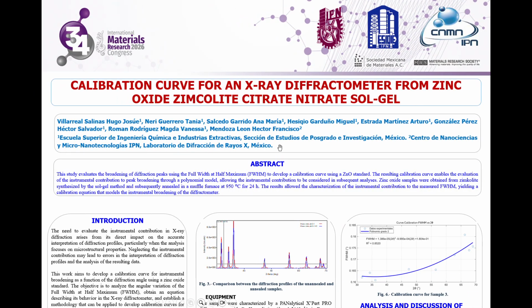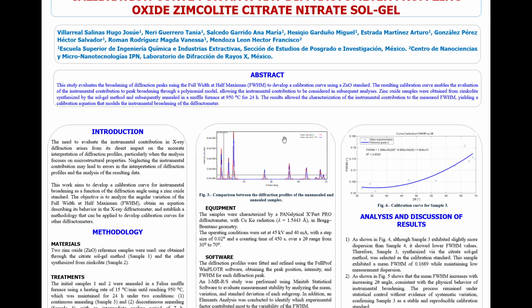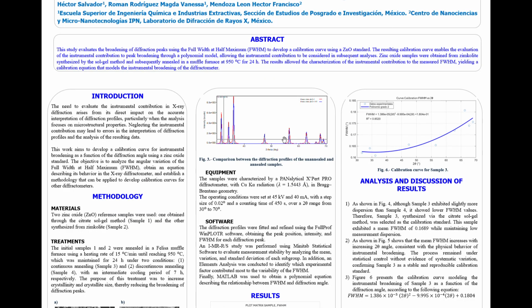In this work, we focus on the broadening of diffraction peaks, but there is a small complication. The broadening we observe in the peaks does not come only from the sample, it also comes from the diffractometer itself, and we know it as instrumental broadening.